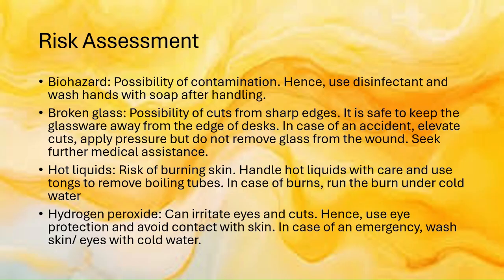There's also the risk of hot liquids because you are dealing with different temperatures. So risk of burning skin is possible. So handle hot liquids with care and use tongs to remove boiling tubes. In case of burns, run the burn under cold water.